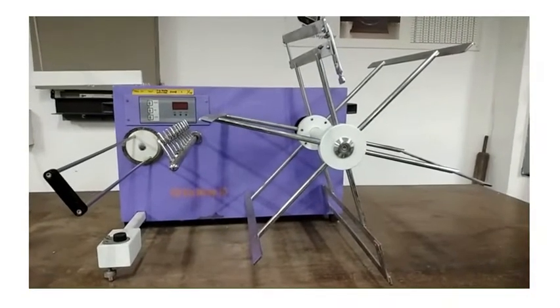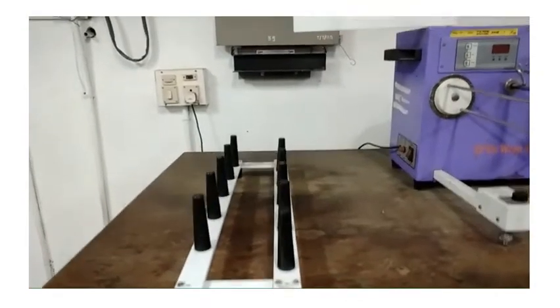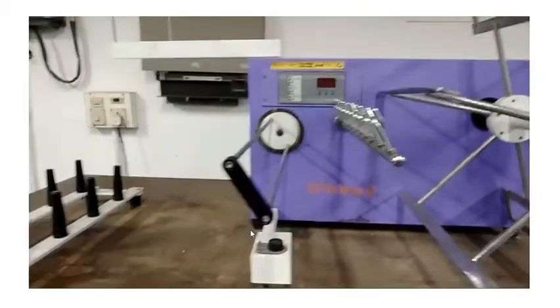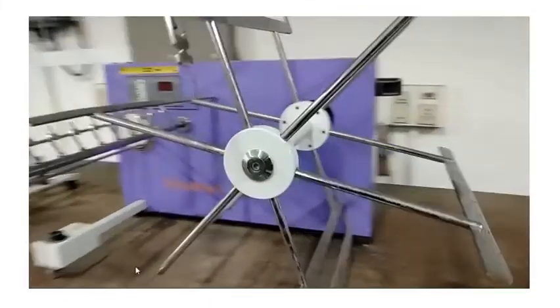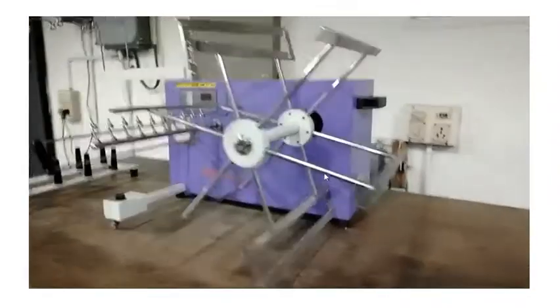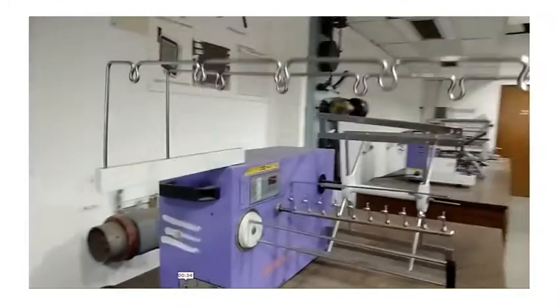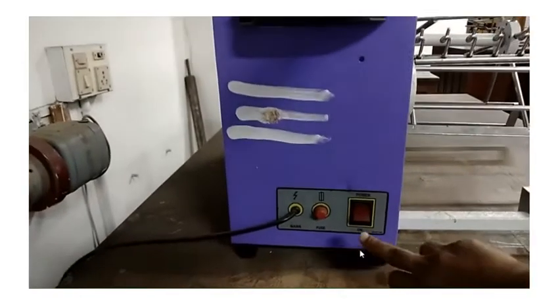This is the front view of the wrap reel. You have the plug at the back. This is the tensioner. This is the guide. The circumference of the reel is 1.5 yards. This is the side view — the right side view of the wrap reel. This is the crane where you keep the cone. This is the guide. Here you have the switch; you can switch it on. Plug main, and then the instrument main is switched on.